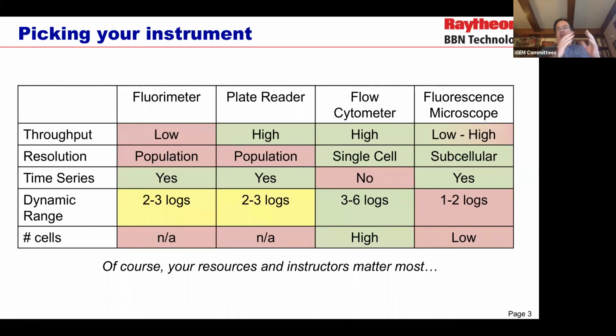You can look at the evolution of fluorescence and OD, giving you some indication of population at the same time. The dynamic range of how great the brightest and the dimmest that you can distinguish is okay, typically around 2 to 3 logs.